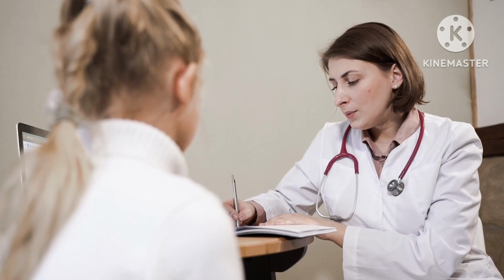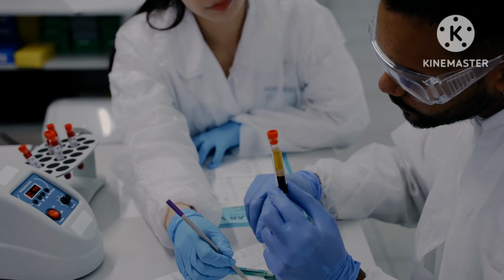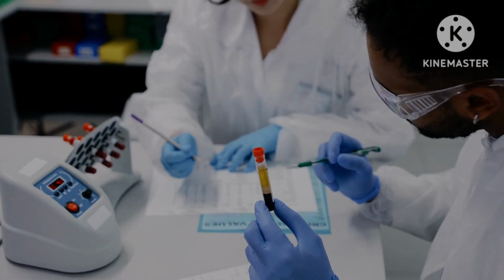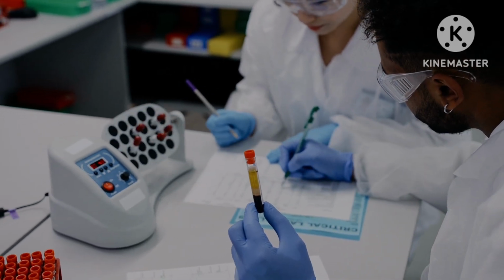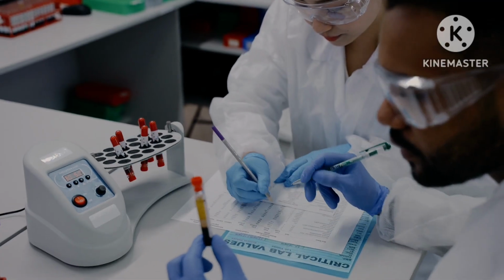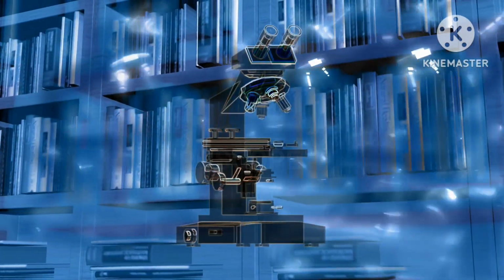When a doctor suspects malaria, an infection, or even a blood disorder, how do lab professionals actually see what is happening inside the sample? Because blood cells, bacteria, and parasites are so tiny that we cannot see them with our eyes, that is where one of the most important instruments in the lab comes in, the microscope.